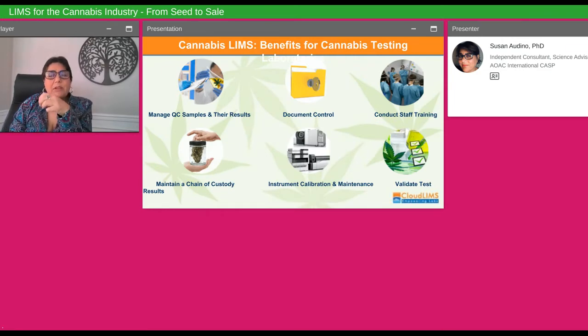With respect to the cannabis testing in particular, as we know, many cannabis laboratories are required to be ISO 17025 accredited. Well, a lot of this speaks to some of that, so maybe this will sound familiar to you. In the cannabis laboratory, we need to manage QC samples and their results.